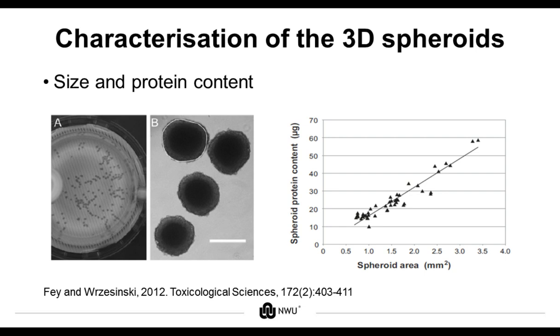After method optimization, each spheroid model is comprehensively characterized to obtain a baseline of the specific model's growth properties and functionality. This approach will clarify when the model reaches its dynamic equilibrium state, indicating when the experimental window can start.